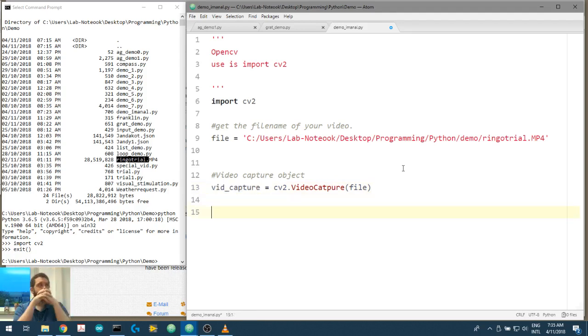So we've got that in the background there. What do we do next? Well, we need to present it onto a window. So what we can do is we can go cv2.namedWindow. I think that's lowercase, yes. And we'll call this OFT for Open Field Test Analysis. So now we're going to have a window and it's named what we name it here.